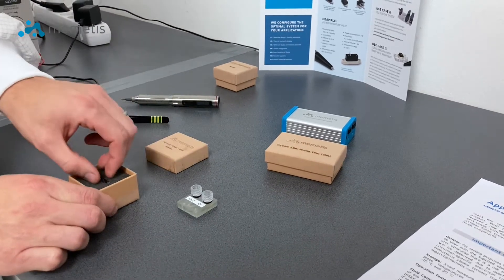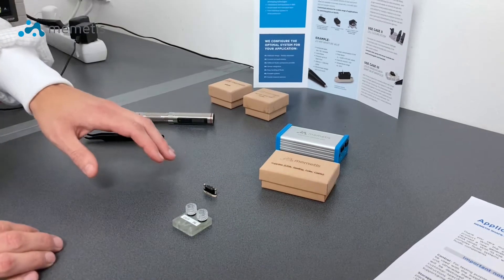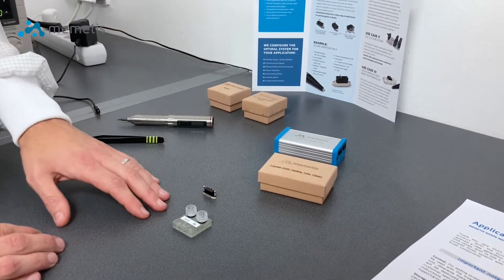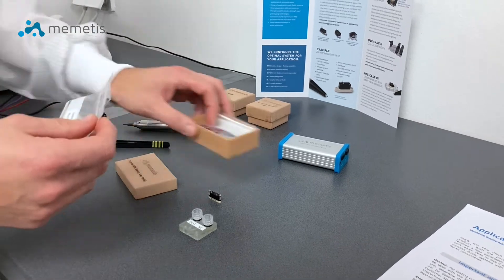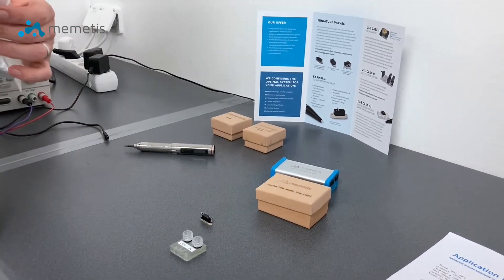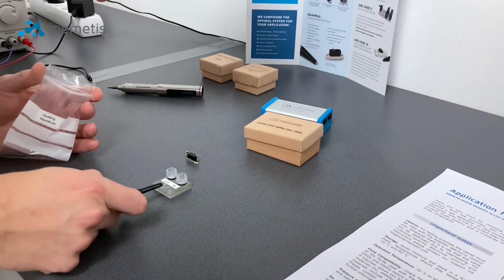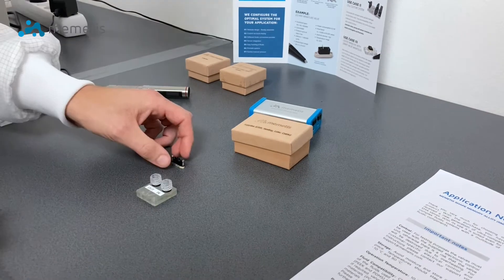Next, you will need to unbox the normally closed valve. But before you can mount the valve on the fluidic connector block, you will need to have a look into the supply package and find the sealings. These sealings are then to be correctly placed on the defined spot on the fluidic connector block.